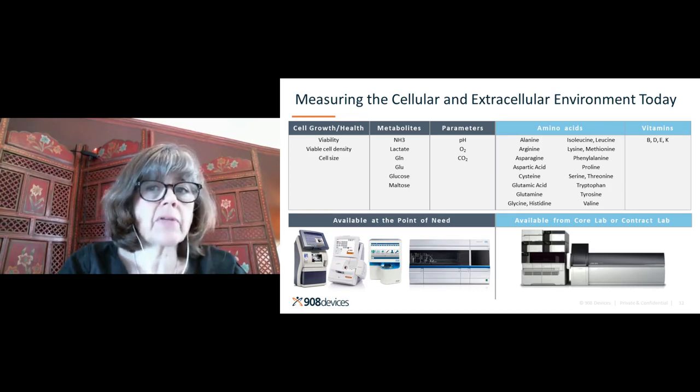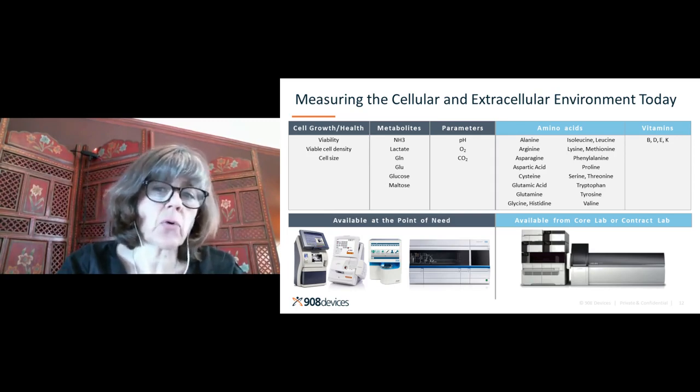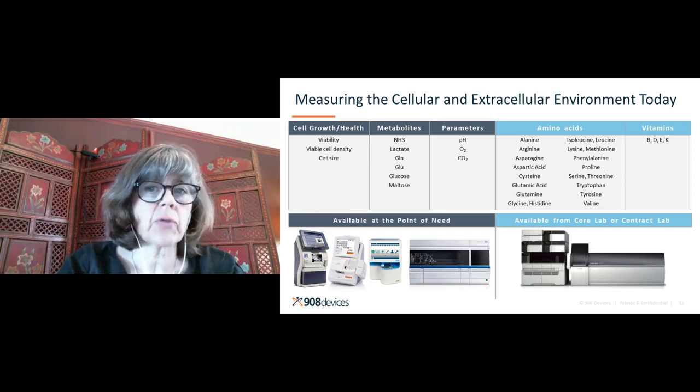The amino acid and vitamin measurements, although they're key, usually require you to take samples and send them to a core lab or a contract lab to get them measured, and it may take several days, and I know sometimes it even takes weeks to get your data back. So it's a little bit counterproductive since these are so important.